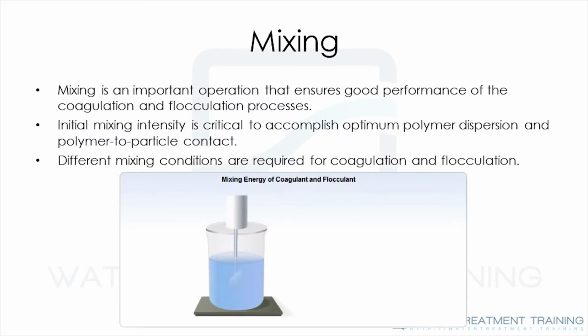Mixing is an important operation in the coagulation and flocculation processes, which directly affect the treatment performance. Initial mixing intensity is critical to accomplish optimum polymer dispersion and polymer to particle contact. Coagulation and flocculation are done under different mixing conditions.